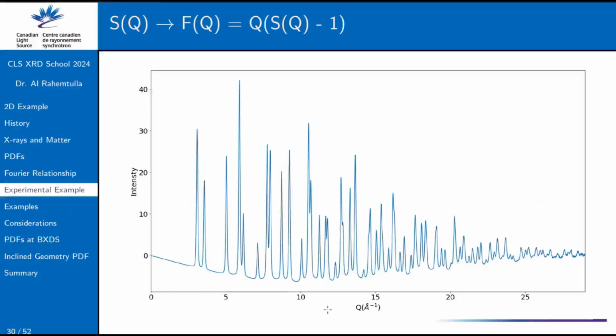In terms of solving that out, we might get a sense when Graham talks about modeling and solving structures through PDFs, where a protein might be pretty difficult to do. I don't want to say it's impossible. Because you're going to have all these different bond lengths that are basically the same. You'll have lots of carbon-carbon bonds and carbon-nitrogen bonds, but you're not going to resolve so much.